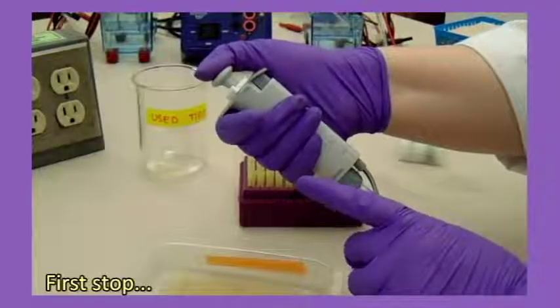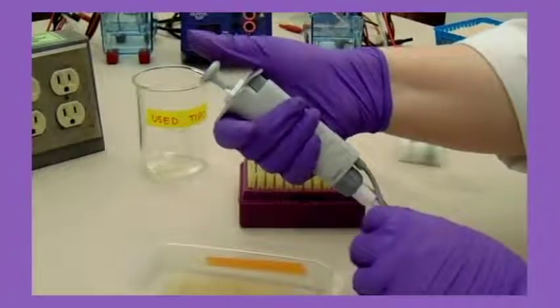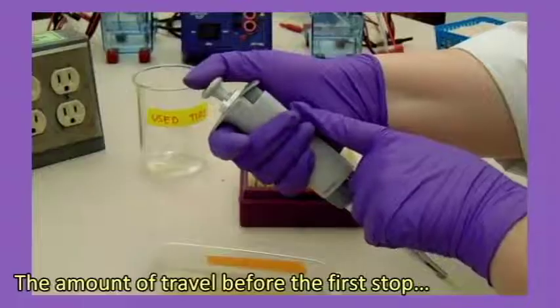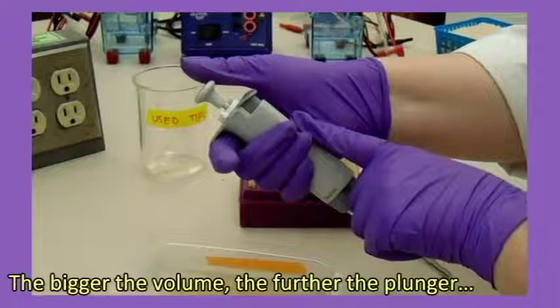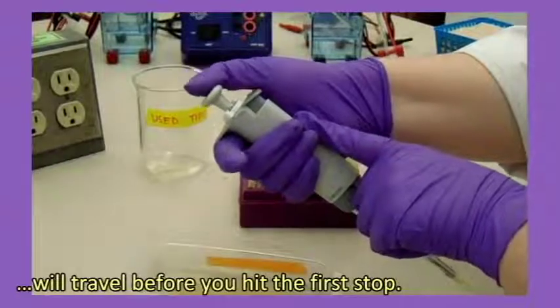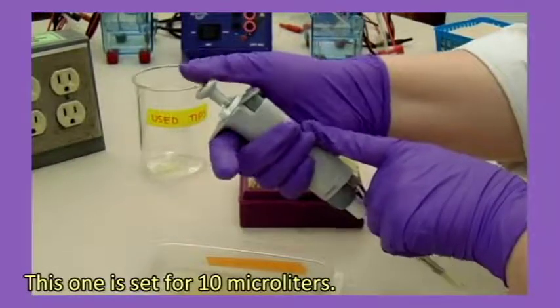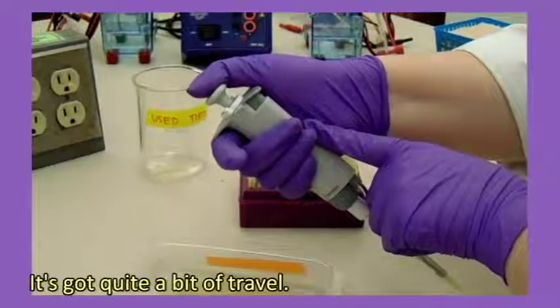The amount of travel before the first stop depends on the volume it's set to. The bigger the volume, the further the plunger will travel before you hit the first stop. This one is set for 10 microliters. It's got quite a bit of travel.